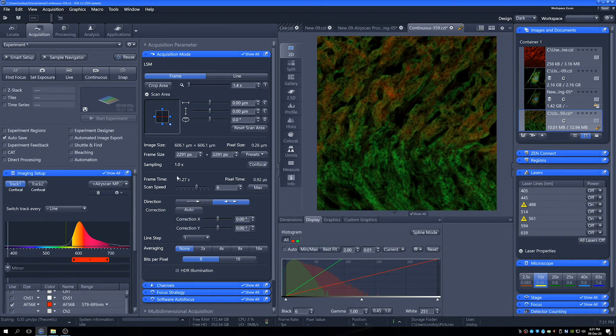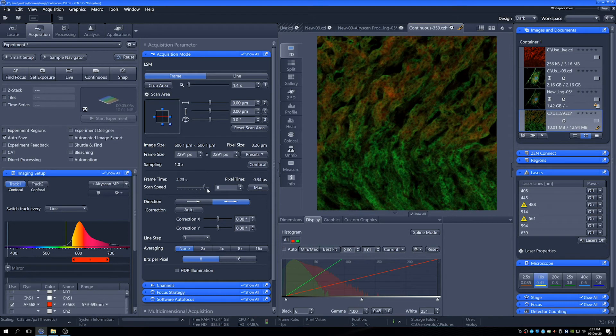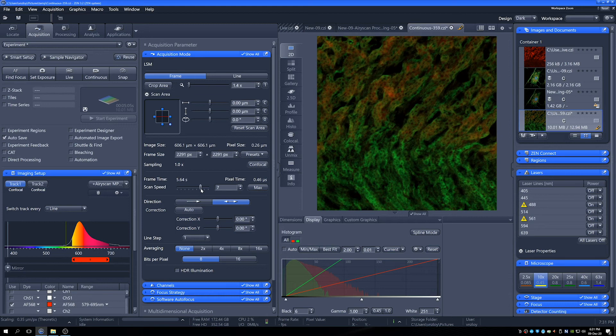Then we can see we've got things like scan speed by here. So we can see what our frame times are going to be. We can control this just by pulling this bar back and forth. We can do everything from scanning for a few minutes to scanning in a few seconds.